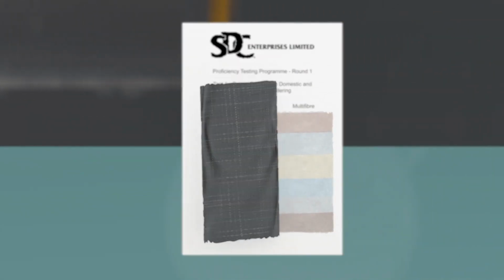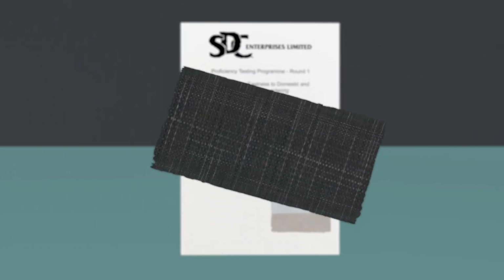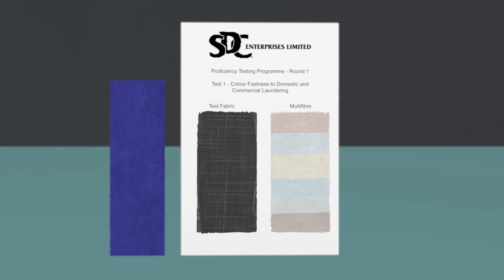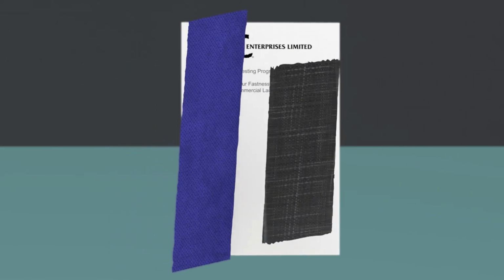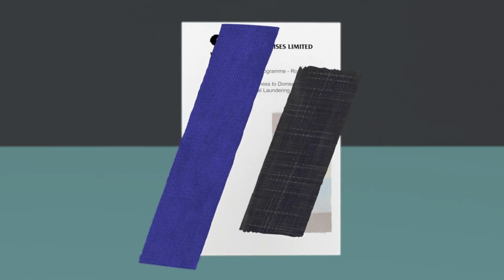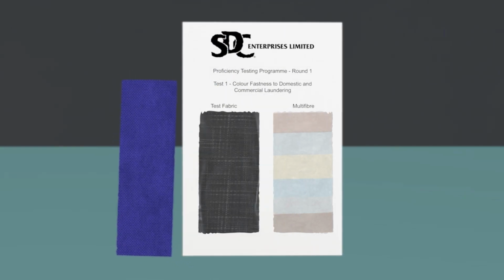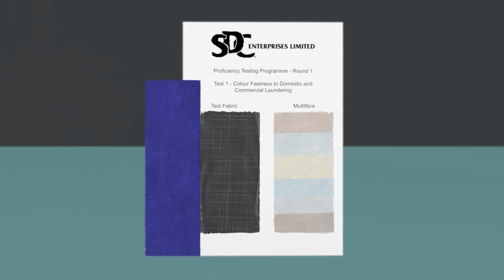Grayscale tiles are highly specified in line with extensive quality control measurement for continuity and accuracy with every test, comparing a constant grey with a degree of loss or fade. Samples should be mounted for ease of assessment. Pay attention to whether the face or reverse of the fabric is being assessed and also the orientation of the fabric. The warp and weft directions should be aligned with those of the original piece of material, because light will reflect differently depending on the orientation.